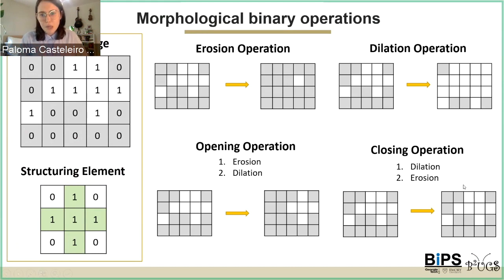There are other operations, like for example, some people use filling operations quite often, which means any area that is surrounded by 1s will be converted to 1s. And MATLAB has a great library of binary operations that you can use, but just know that a lot of them rely on erosion and dilation.